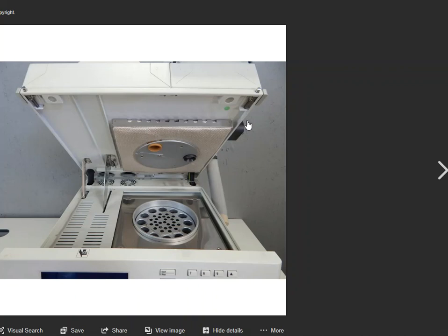Okay, so that is where your container would basically be lowered into this oven, and this oven is insulated just like the GC door is and the oven to the GC, so that it can help control the temperature a little bit better for you. There are multiple vials up underneath this tray because it knows that it can be processing one sample and it can start bringing the second sample into the tray and into that area and begin processing that one as well. That saves you a little bit of what we would call hold-up time, right?